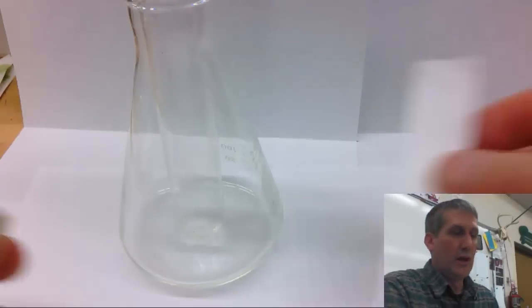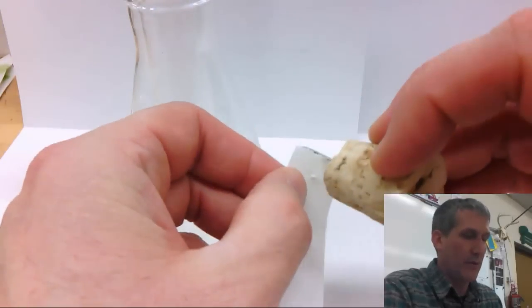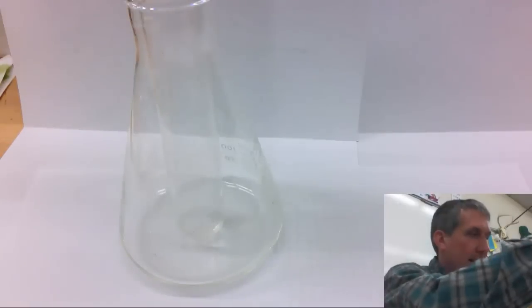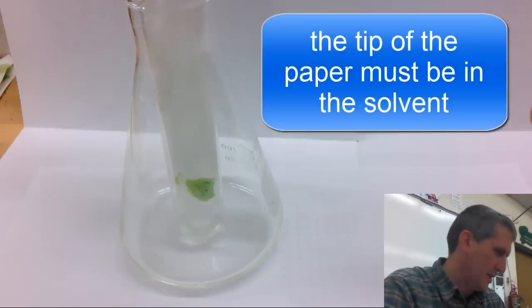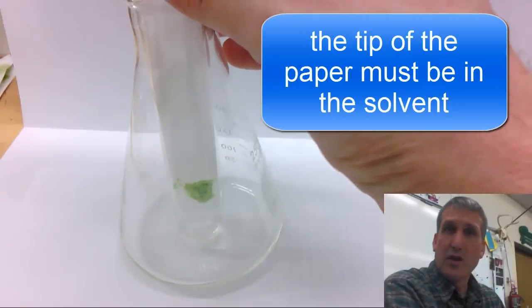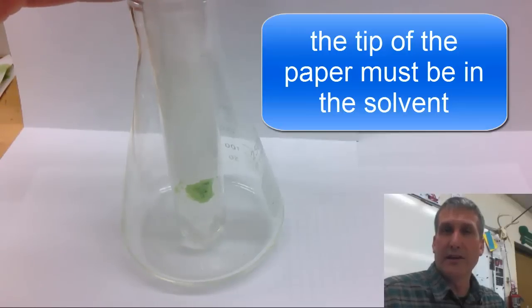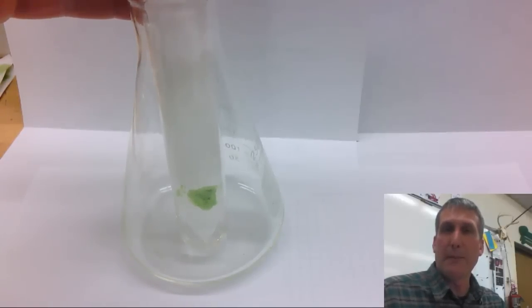Now you need to assemble the paper and put it in the tube so that the tip is touching the chromatography solvent. So you put your paper back on your paper clip and you slide it down into the tube until the tip is just touching. You want to make sure that the pigment is not touching the solvent. You want the pigment to be picked up by the solvent as it moves up the paper.